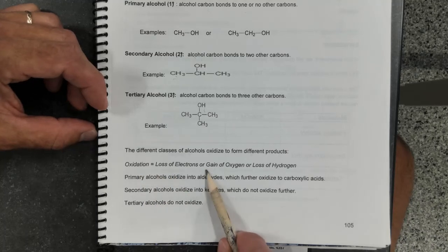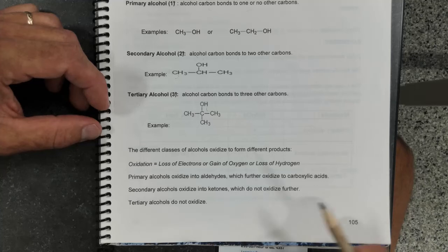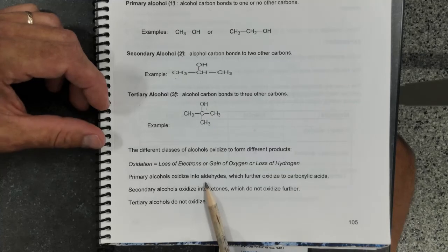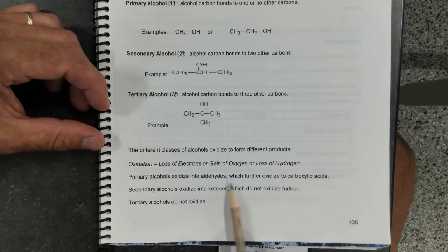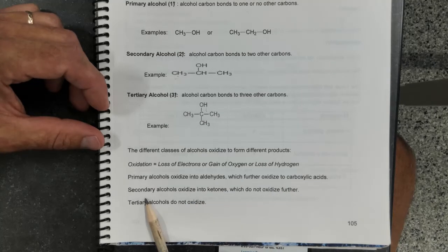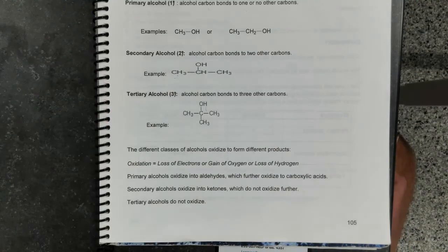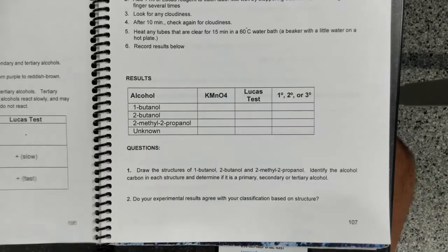Oxidation is the loss of electrons, or gain of oxygen, or loss of hydrogen. So primary alcohols, when they are oxidized, turn into aldehydes and oxidize further to carboxylic acids. Secondary alcohols oxidize into ketones. Ketones do not oxidize further. Tertiary alcohols do not oxidize.